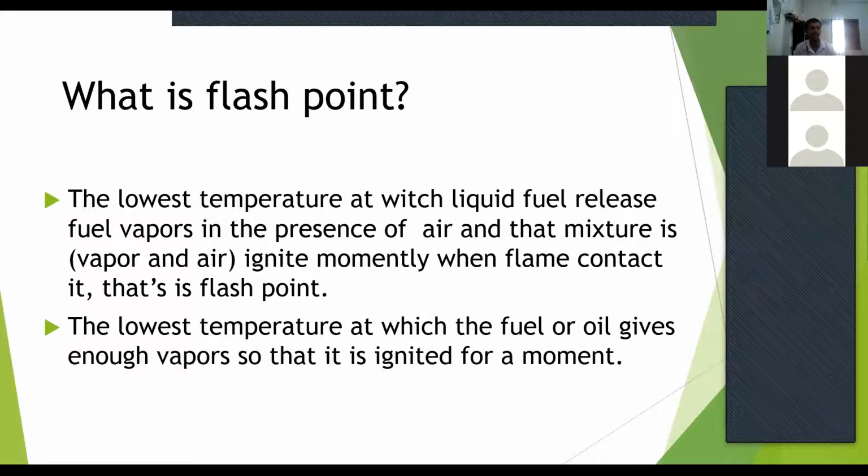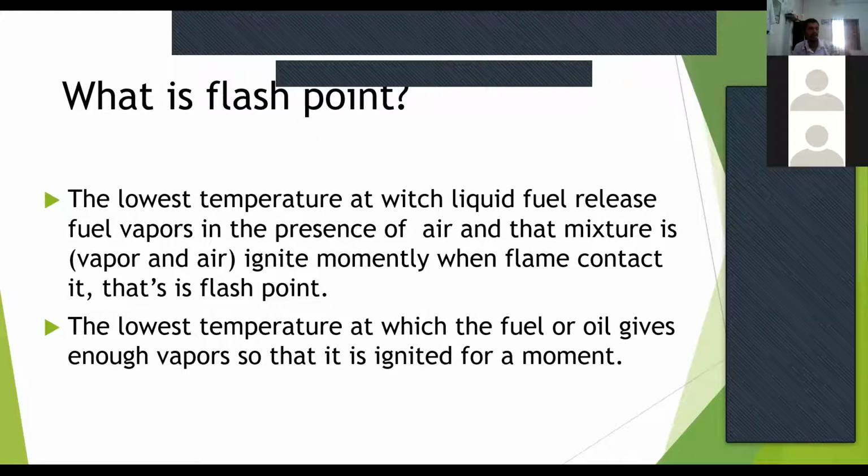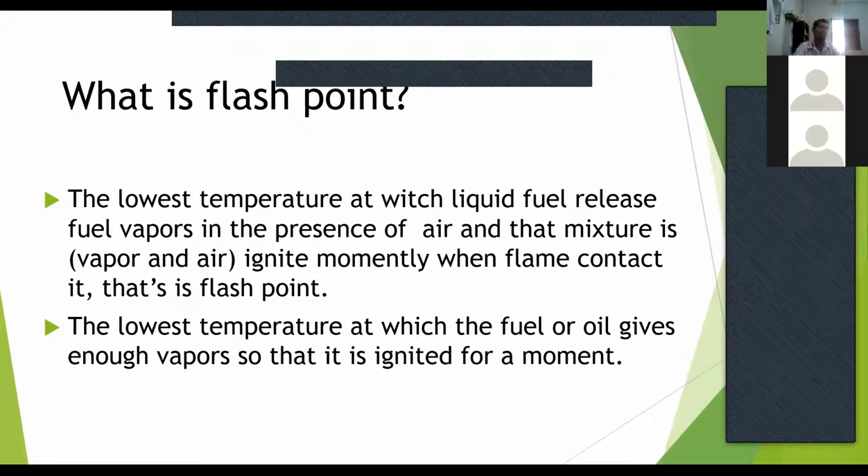As the temperature increases up to a certain point, the amount of fuel vapor increases. At one point there is enough vapor that if we introduce fire into that air-fuel vapor mixture, it is able to ignite. That is called the flash point.